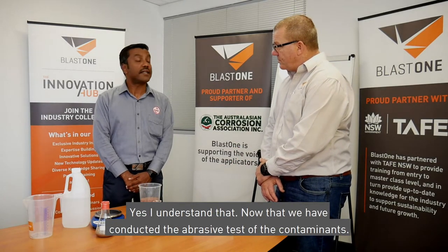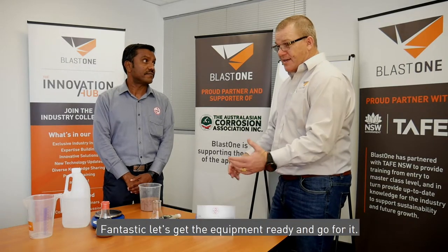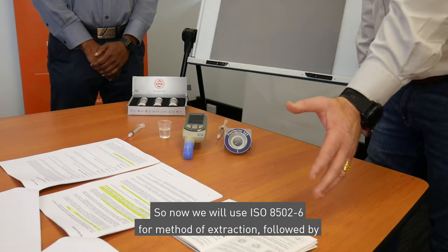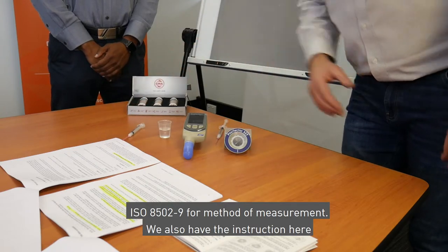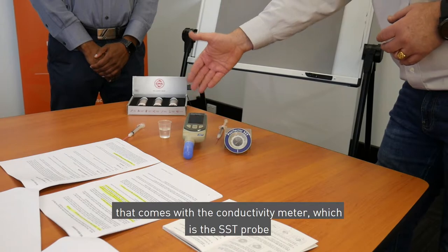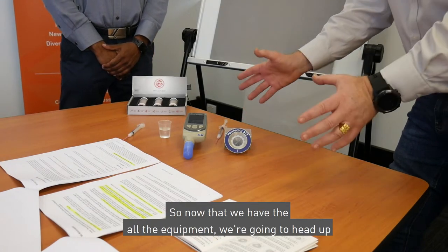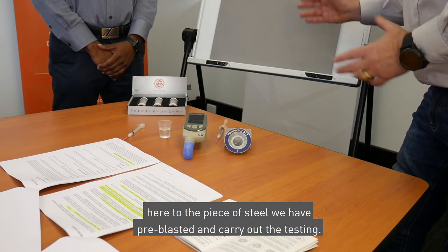Now that we have conducted the abrasive test of the contaminants, let's go ahead and do the conductivity test on the surface. So now we will use ISO 8502-6 for method of extraction, followed by ISO 8502-9 for method of measurement. We also have the instruction here that comes with the conductivity meter, which is the SST probe, along with the Positector patch which is in line with the Bresle method. Now that we have all the equipment, we're going to head up to the piece of steel we have pre-blasted and carry out the testing.